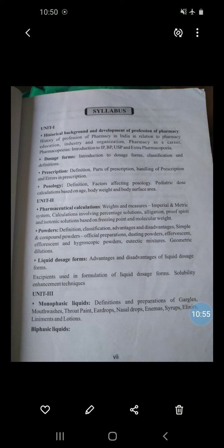Then what is the procedure for preparation of the syrup? Before that, we'll see the theory. A syrup is a thick viscous liquid containing a large amount of dissolved sugar but showing little tendency to deposit crystals. The viscosity buildup occurs owing to multiple hydrogen bonds between the dissolved sugar and the water.